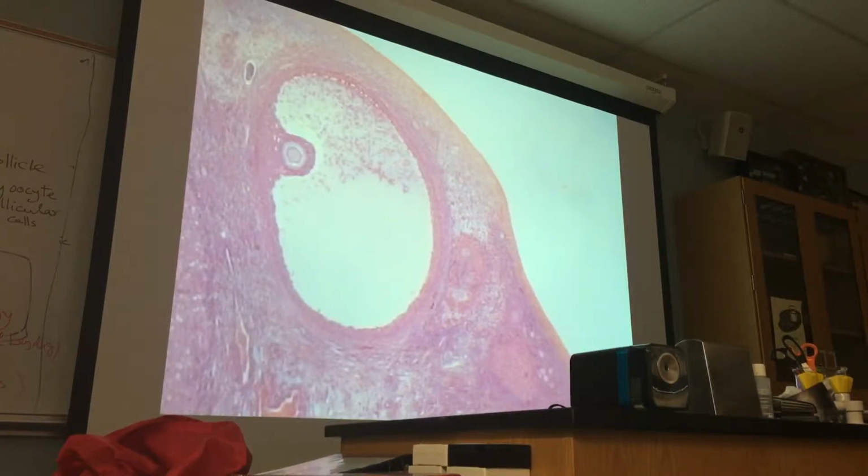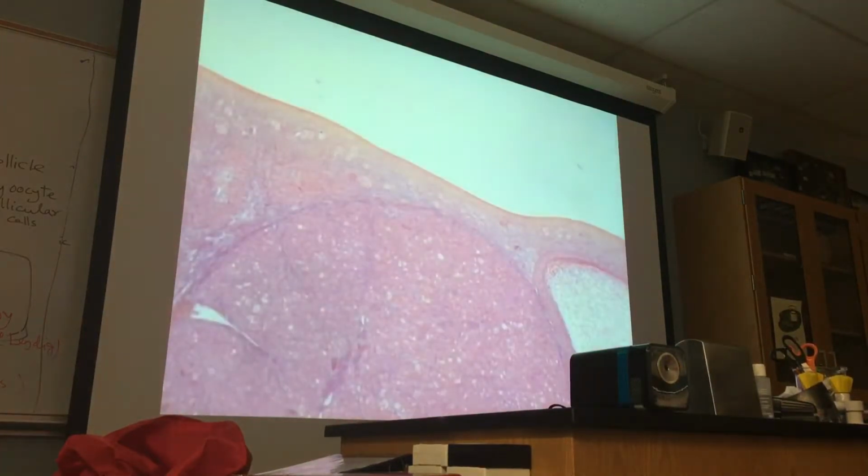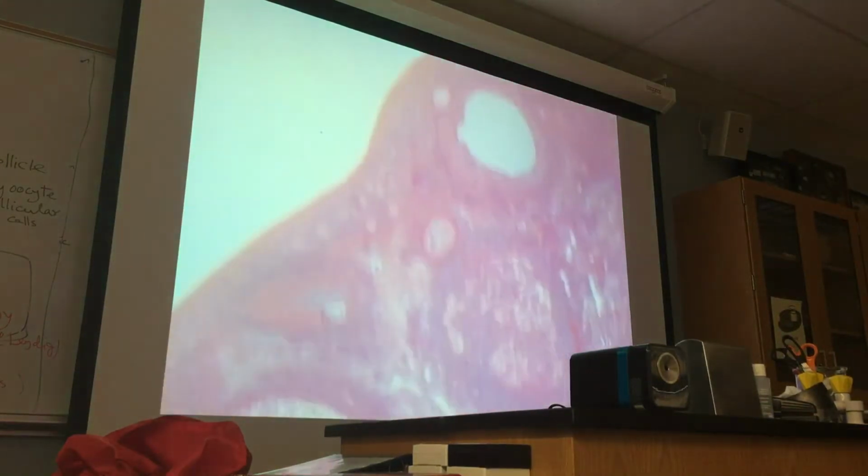Now, first of all, we have to learn about the primordial follicle. And they are really beautiful.